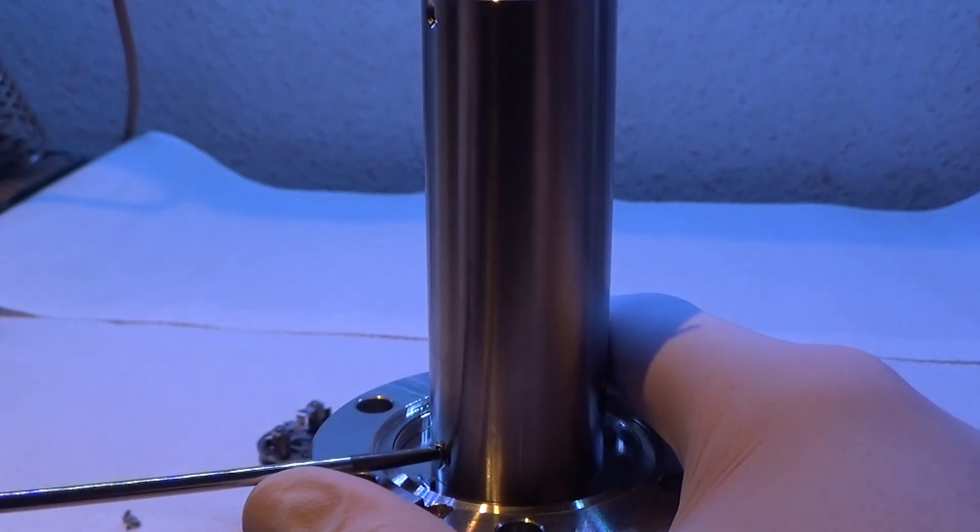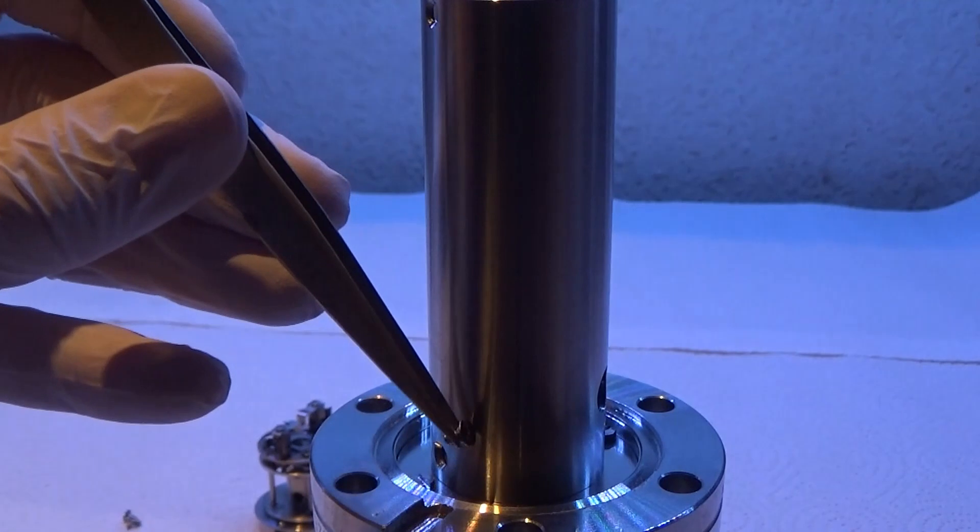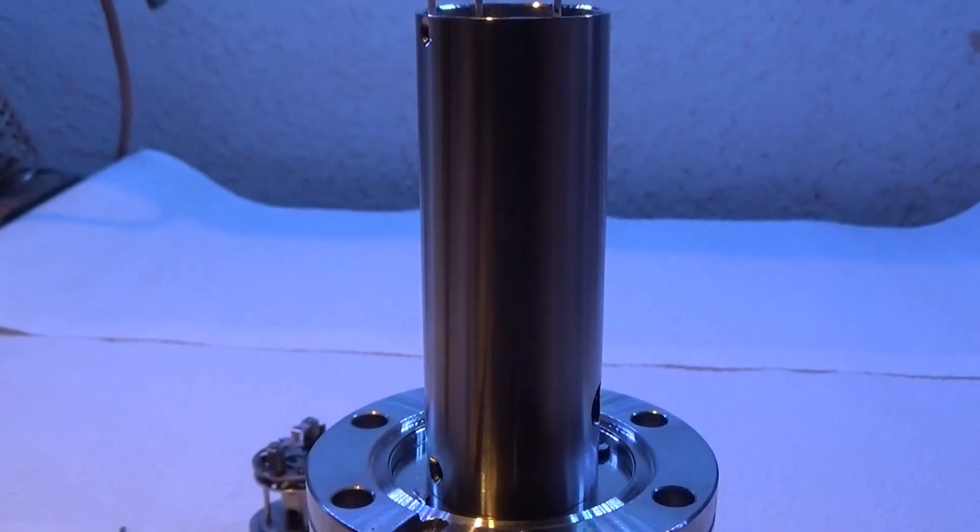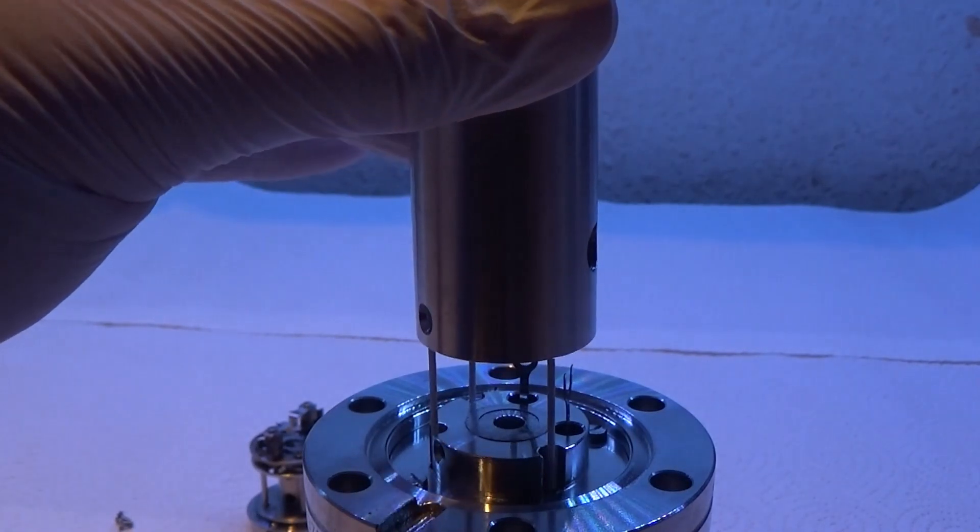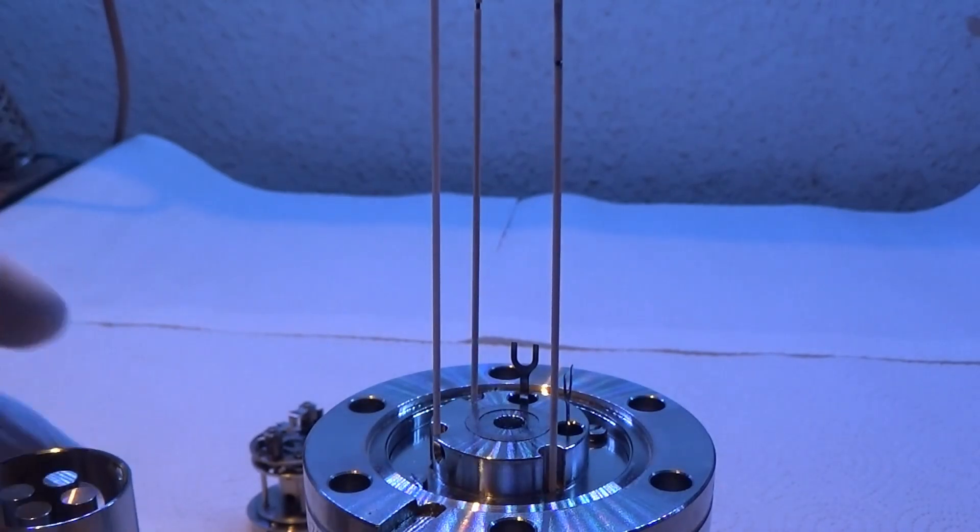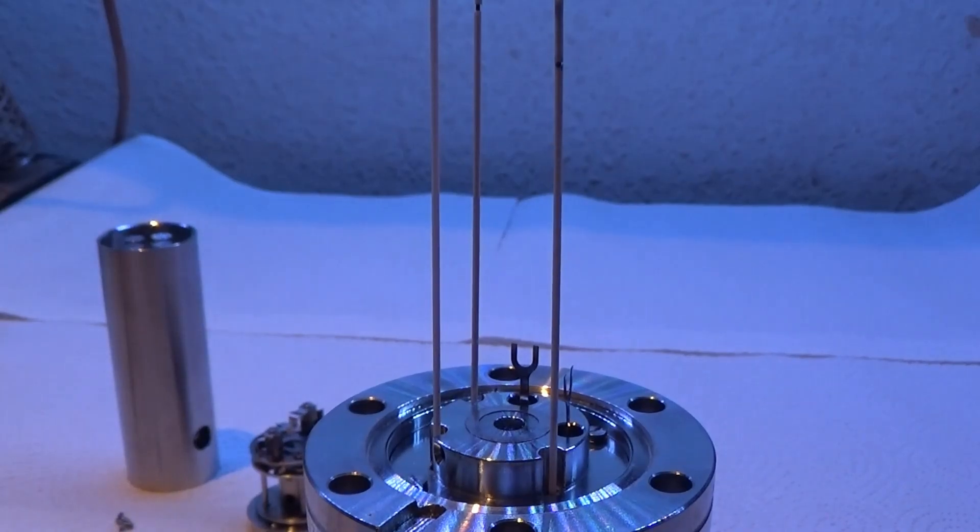So with the quadrupole, we can now both generate cations and impose conditions of what mass to charge ratio ions will go through the system. And now we need a way to detect those ions. And that's basically two ways of doing it. Either by counting the ions individually with a particle detector, like a scintillation counter or channel electron multiplier, or we can count the current with something much simpler, which is exactly what we're doing here.